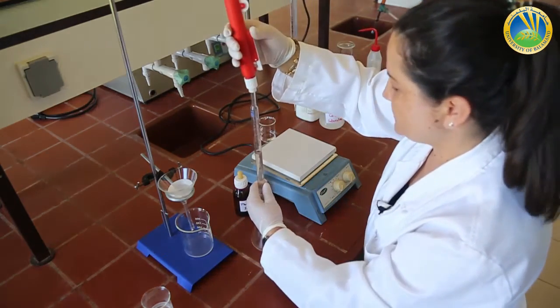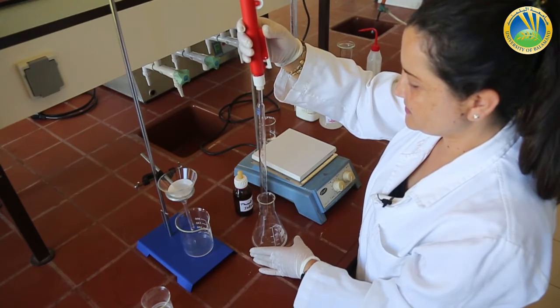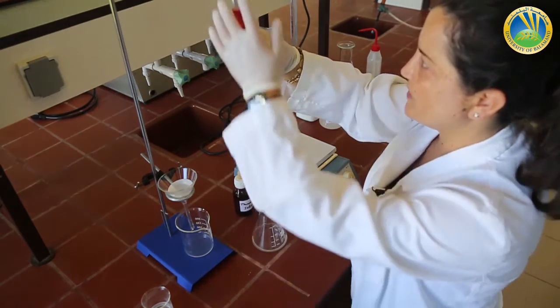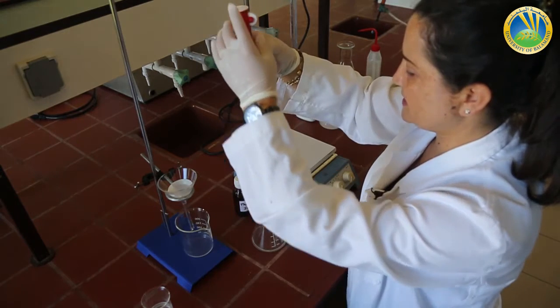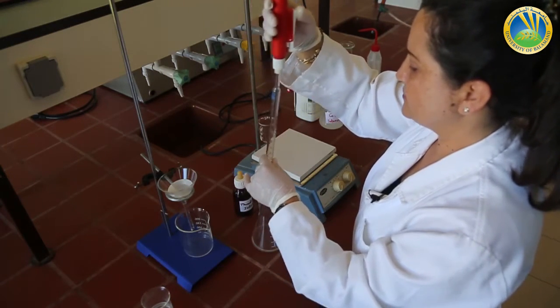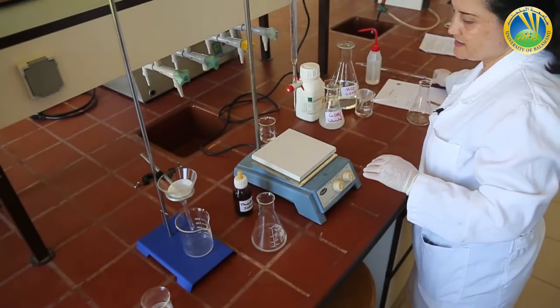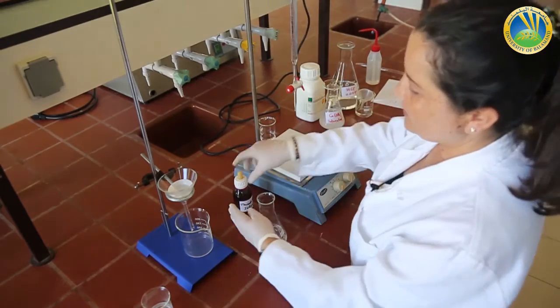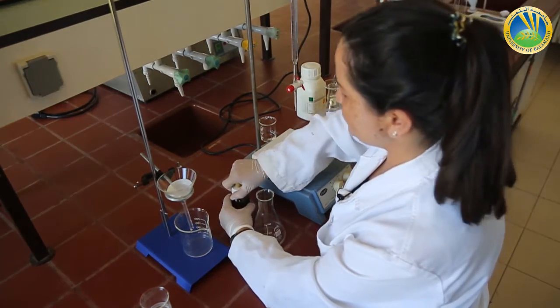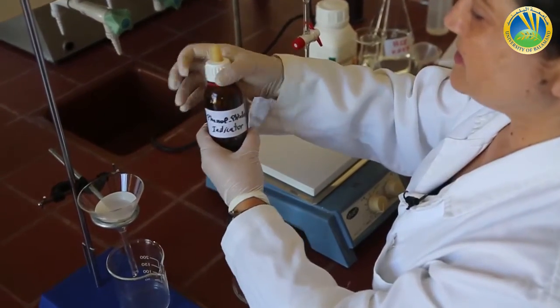I have my 25 milliliters of filtrated calcium hydroxide in the Erlenmeyer flask. While I titrate this amount, the calcium hydroxide continues to be filtrated for the second titration later on. Now I add two to five drops of phenolphthalein as my indicator.